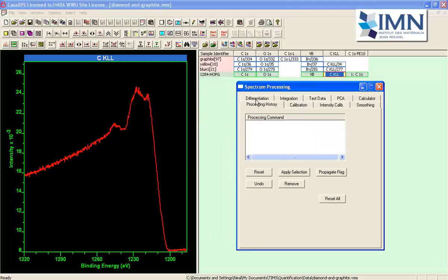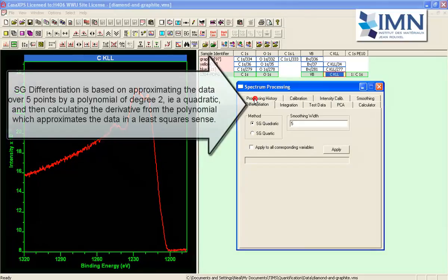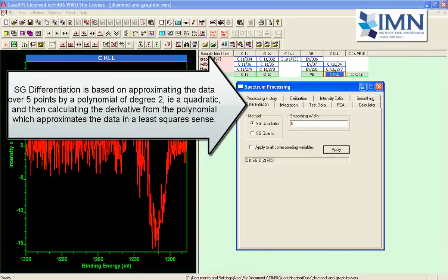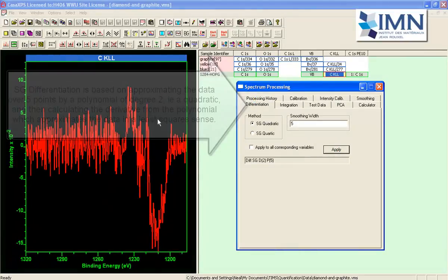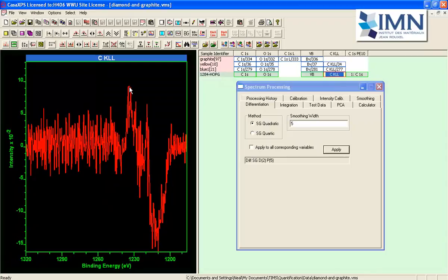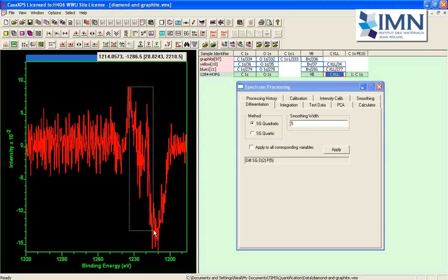So if we just do a differentiation using a Savitzky-Golay then we end up with a lot of noise but the idea is to work out this type of distance here.